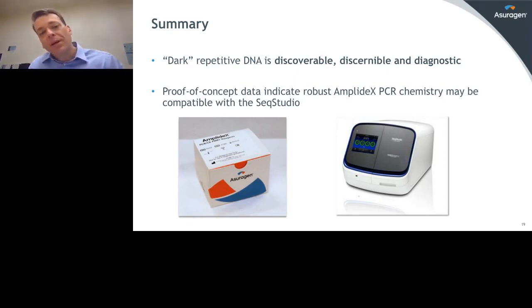So I'm going to wrap up here by saying that we have moved on from the GWAS era and arrays to look at SNPs and understand associations, to go into other categories of sequence that can be meaningful at the level of cell function and disease. And that includes repetitive elements. Historically, repetitive DNA has been thought to be phenotypically neutral. But now we know that is simply not the case. We know that these, in many cases, are elements that are increasingly discoverable, knowable, and have diagnostic implications.